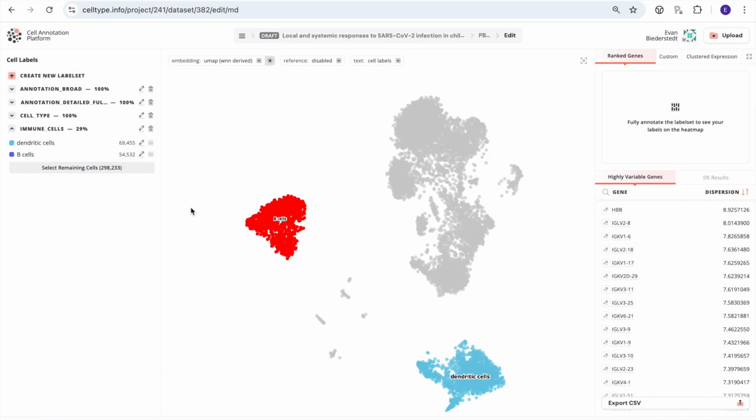Let me see, this is updated. And you can basically go through this entire data set to provide these cell annotations. It's not existing within this data set, but often users provide other information that one could use to calculate these cell annotations. There's often a clustering that's saved within the data set, which didn't take place here, as it's an integrated data set. But based upon clustering of the cell annotations, you should be able to, as a user, select those various clusters and provide cell annotations.